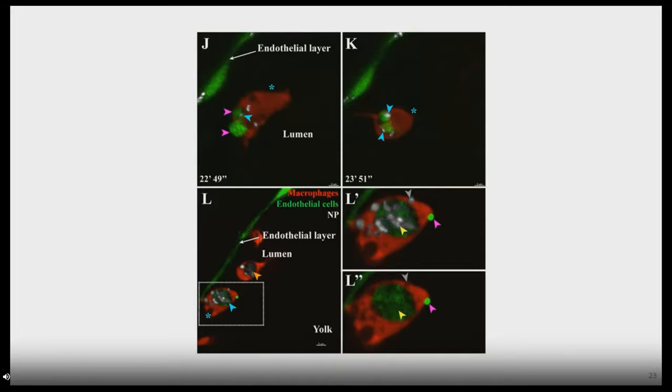We looked a bit after, and the macrophage matures everything. You see the GFP signal getting lower because it is being quenched by the acidity of the compartment, while some GFP seems to be expelled by the cell. That was very unexpected. It seemed that macrophages could just take bits of endothelial cells, and we didn't know this mechanism.